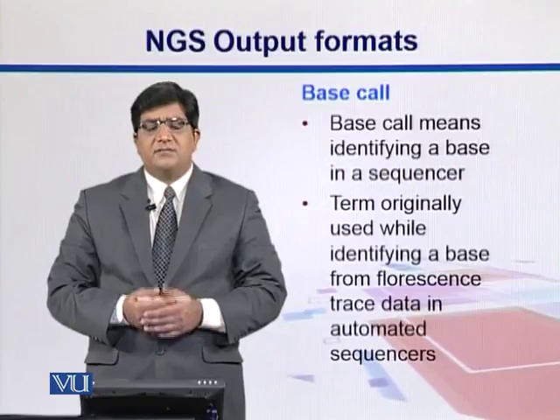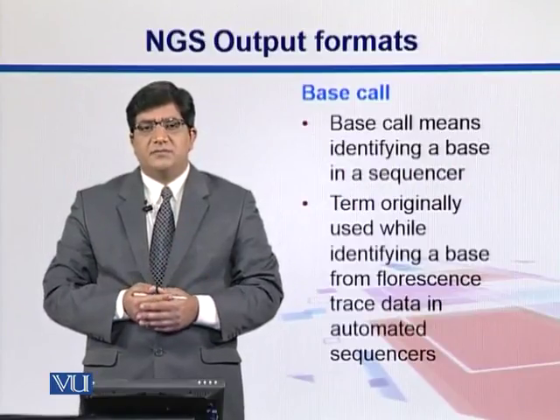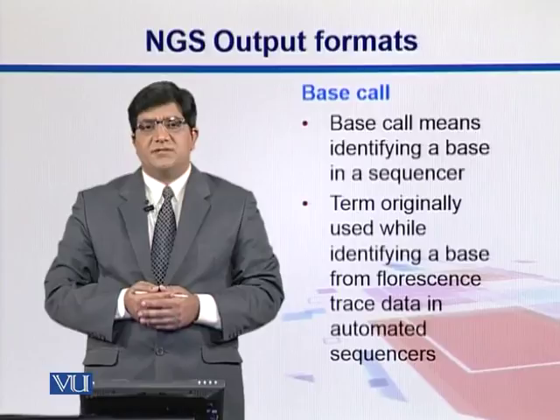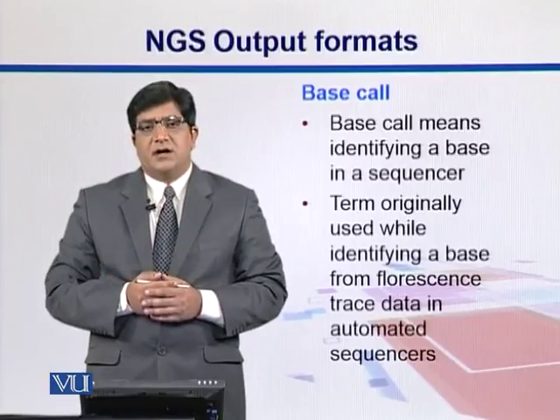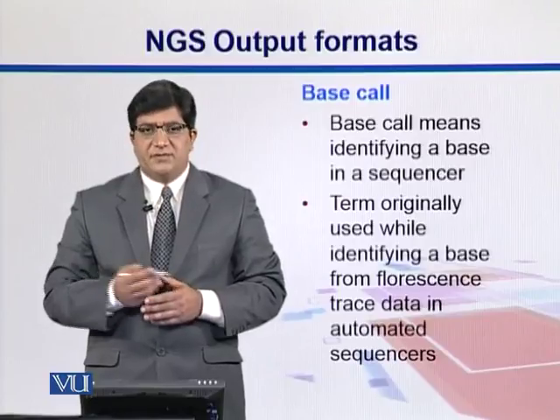Base call is identifying a true base by using the signal which is coming from sequencers. That term was adopted when Sanger sequencing was automated in automated sequencers.